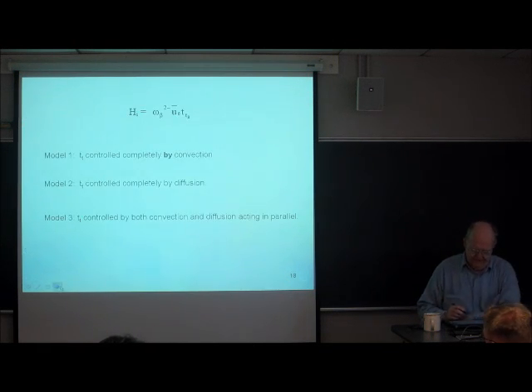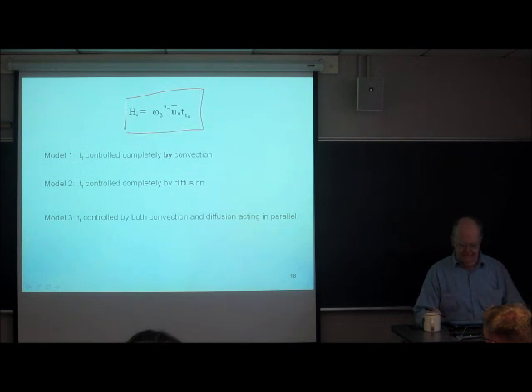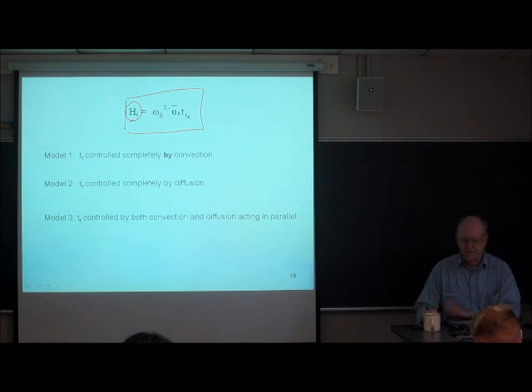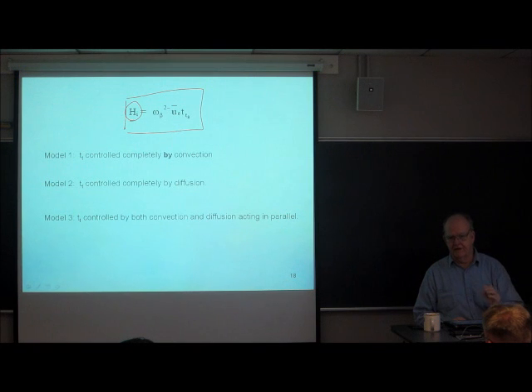Okay, this is where we got to at the end of the last lecture, and it says that the contribution to the HETP from eddy dispersion, from the flow-induced dispersion, I'm going to say that again, the contribution to the HETP from flow-induced dispersion.